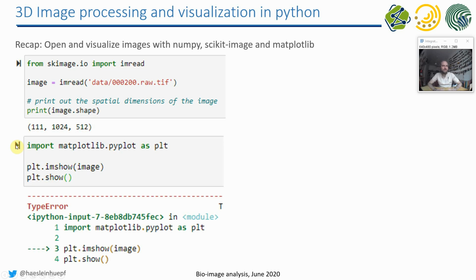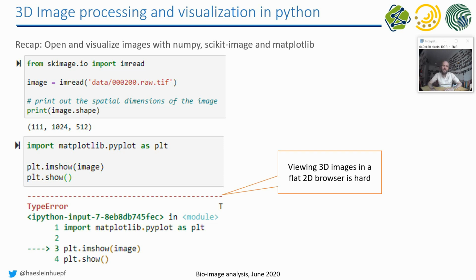And if you then want to visualize this image with matplotlib, you get an error message, simply because viewing 3D images in a flat 2D browser is hard. There are ways to deal with that.